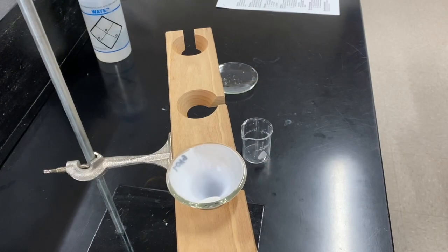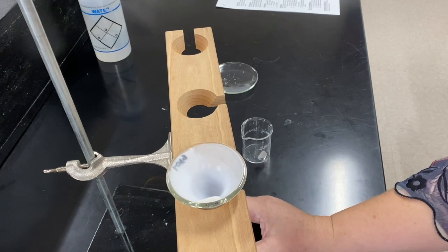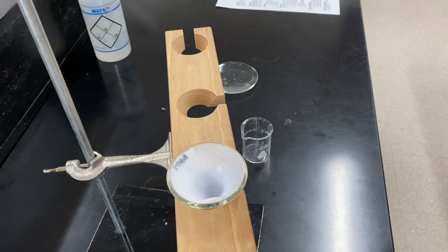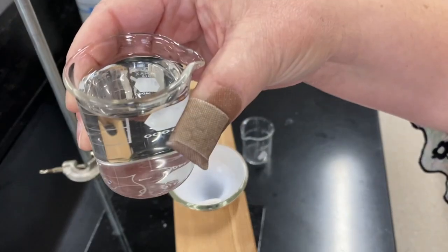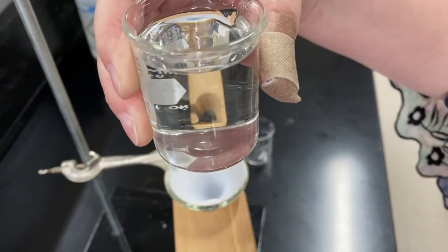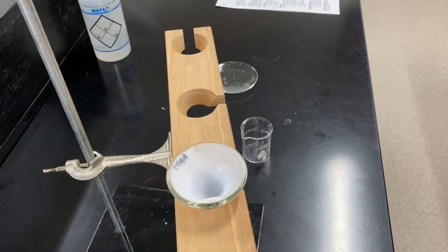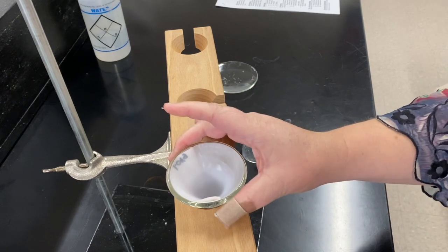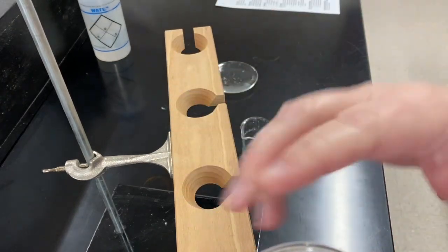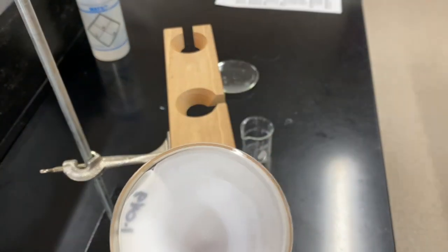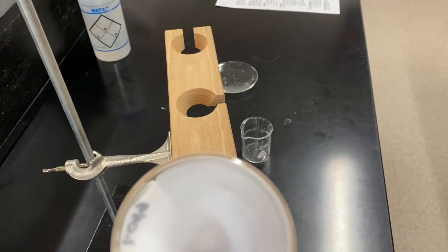Alright, so now that the filtration is done, you can see that the solution that is left is clear and colorless, exactly what we want. That means there's no precipitate that made it through the filter. You can see that the filter paper has almost this frosting-like look to it. That's all of the white precipitate.